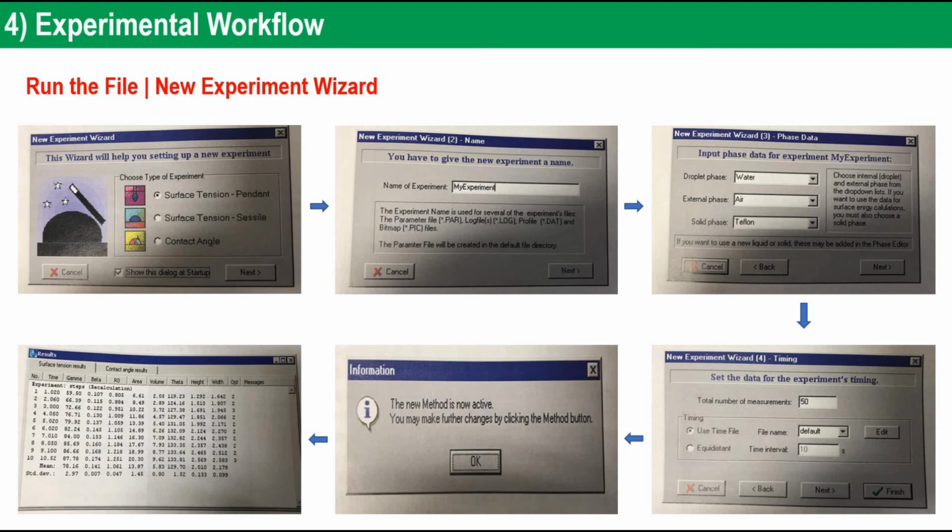The following information message is displayed. When pressing the OK button, you will be presented with the option to run the experiment right away. If you select Yes, the experiment will be started in the ordinary way. After setting the cursor position, follow the density difference. Click Measure to start the measurement, and the data will be shown in the Results window.